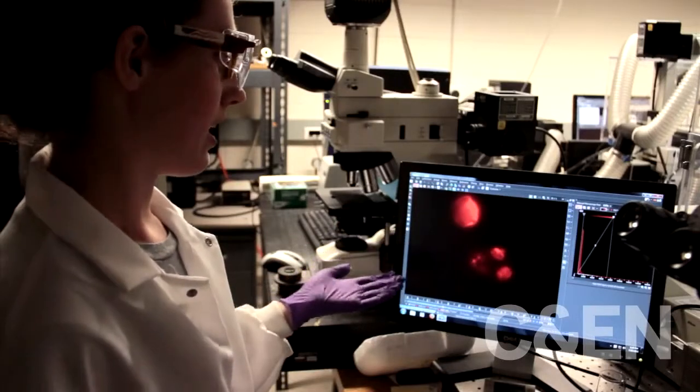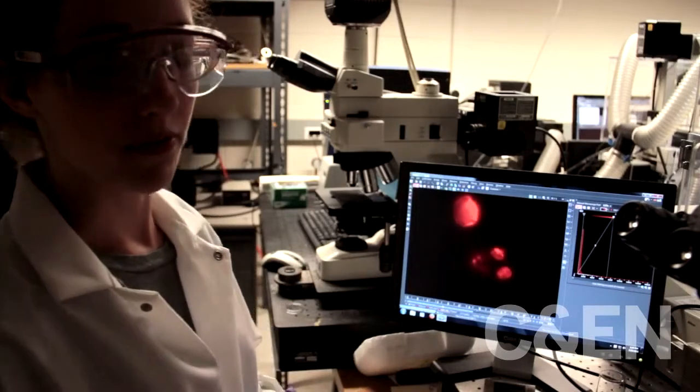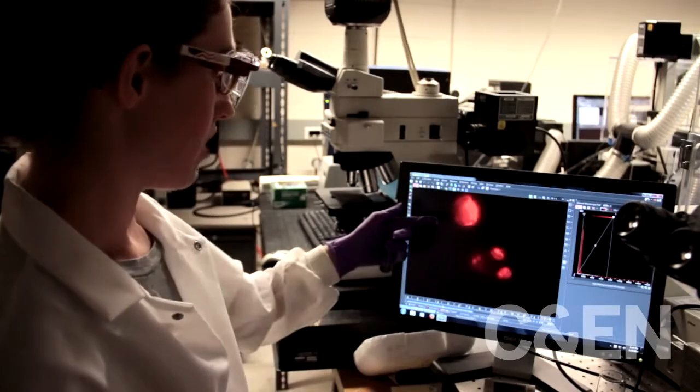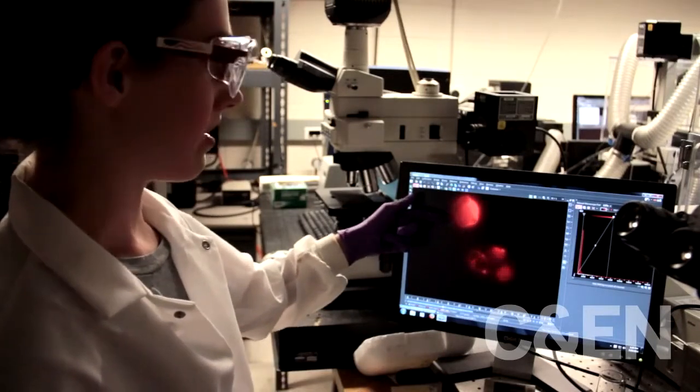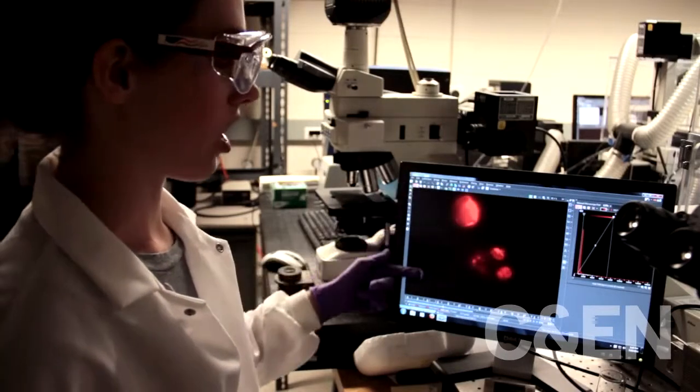The video is looking at different focal planes. So it focuses on the bottom of the cell and then up to the top of the cell. And you can see that the glowing is the brightest around the perimeter of the cell where the quantum dots are adhered.